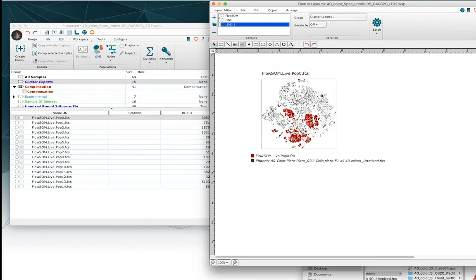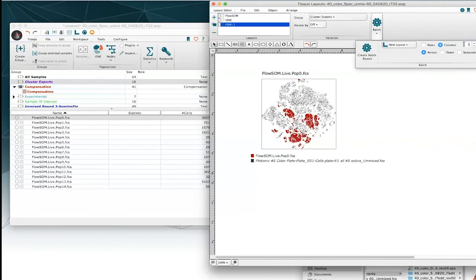Now I'm pretty much ready to batch — I just need to choose how many rows and columns I want. I'm going to use five columns, which will mean three rows since we have 15 clusters. And now I'm ready to batch.